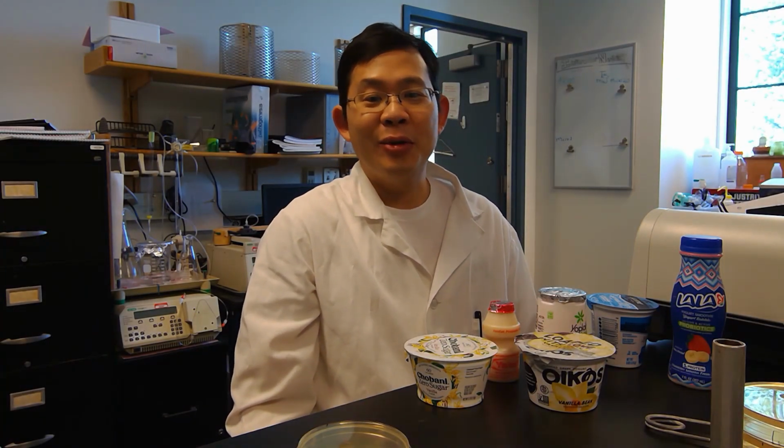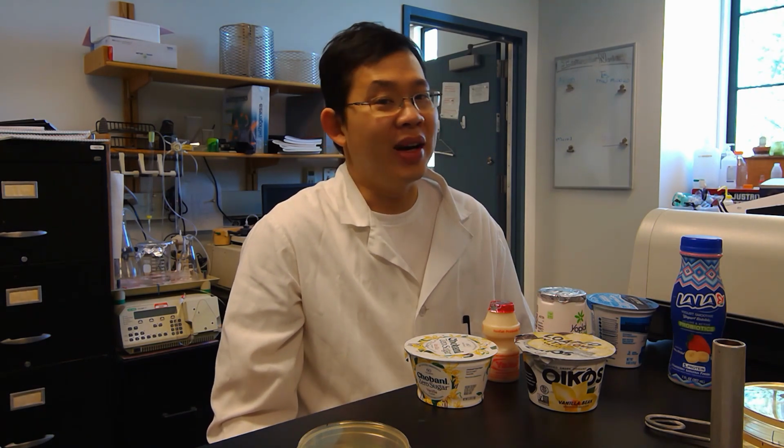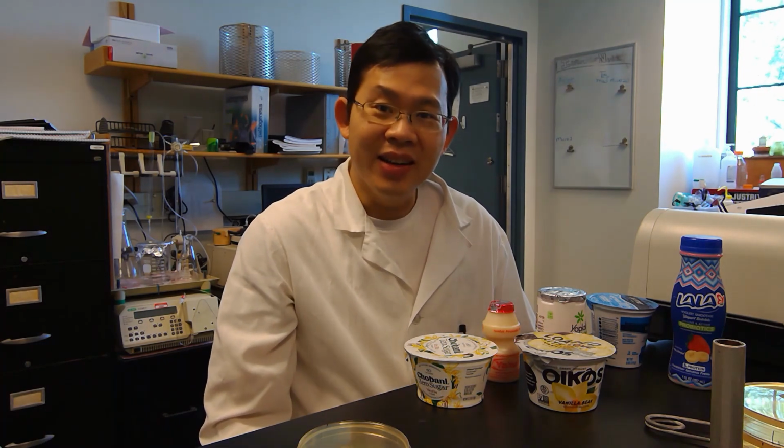Today we are going to do a demonstration of a technique that's commonly used in microbiology lab. That is the streak isolation. Are you ready? Let's go.